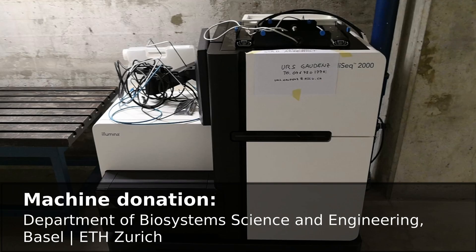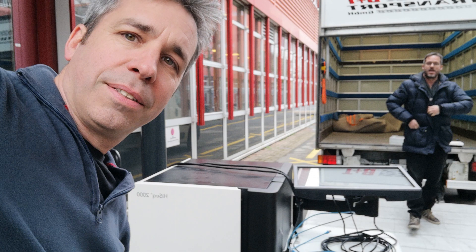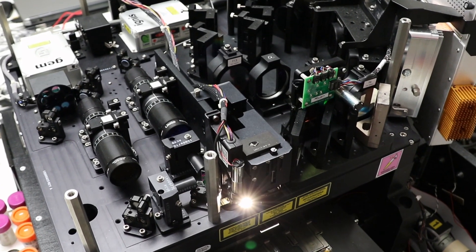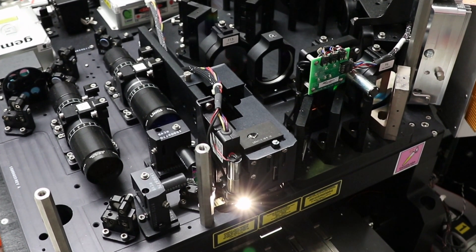When I started looking into the machine, a lot of people would tell me this is a black box. I made myself a challenge to try to reuse the whole system as it is. And by digging into it little by little, I figured out how the individual components work and how they were connected.